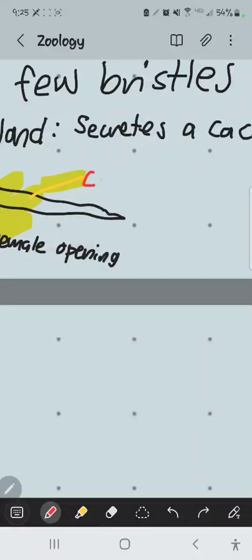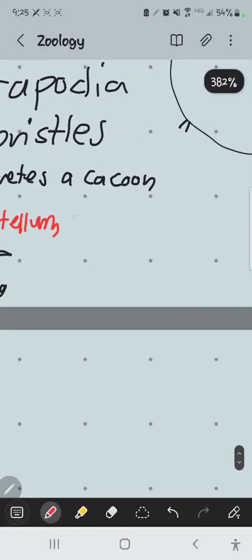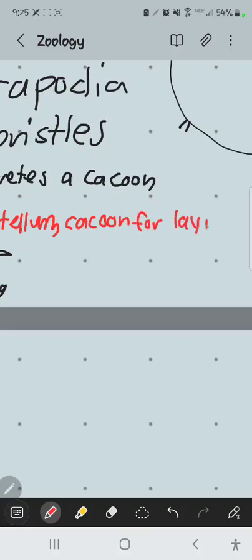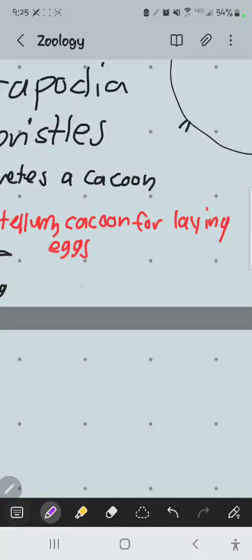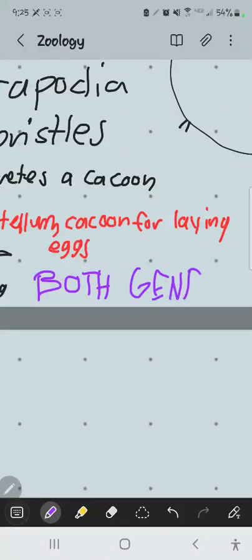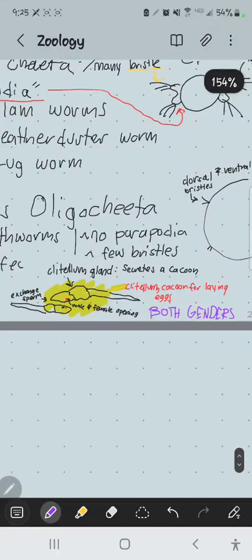So again, on the test, I'll probably have an earthworm on the exam, and ask you what that structure is called and what it's used for. And then I might ask you about gender, male/female, right? So be sure you know that these are actually male and female combined together in the same worm. Okay. So oligochaetes, few chaetae, no parapodia. They're basically freshwater and semi-terrestrial.